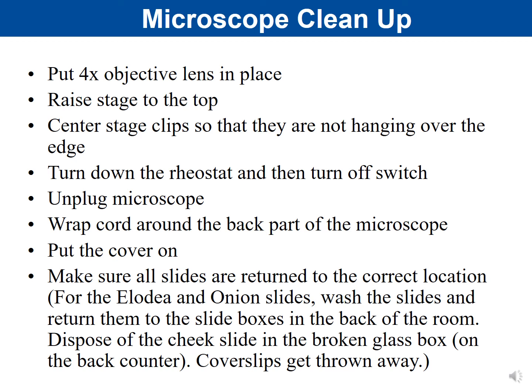and then turn off the switch. Again, because remember we talked about that when we go to turn on our microscope, before we even plug it in, we want to make sure that the switch is off and the light intensity is down. So same idea when you put it away. You want to make sure that the light intensity is all the way down, then turn off the switch, and then unplug it. And then that's ready for the next person to use it. You would wrap the cord around the back part of the microscope. You would put the cover on it. Don't worry about how you would dispose of the slides, but I just wanted to make sure to still cover how to clean up your microscope.